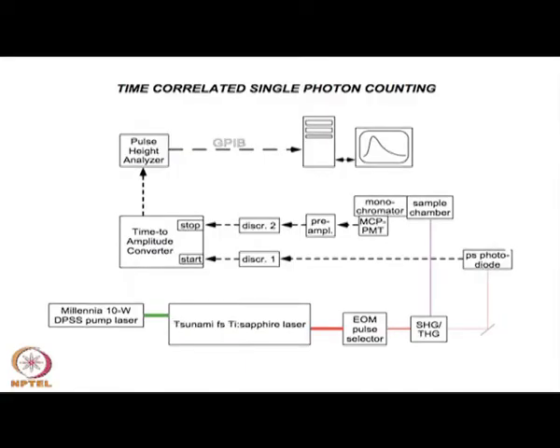So, that is why you need a sufficient number of counts, I mean maximum count, maybe 10,000 counts or even more than that. So, the higher the maximum number of counts, the higher will be the possibility to get a better result. Okay. So, this is very important.